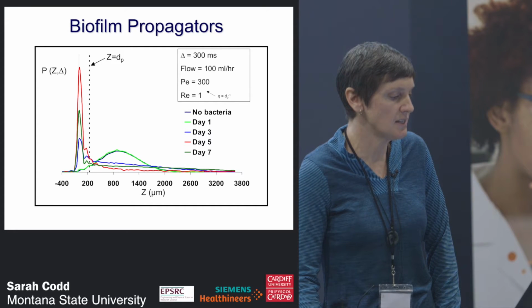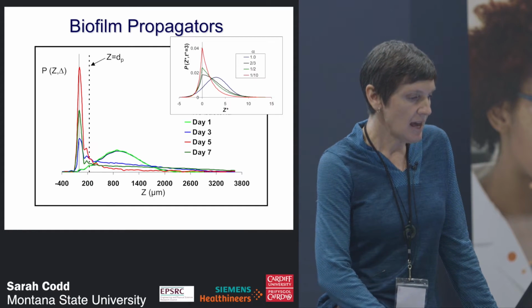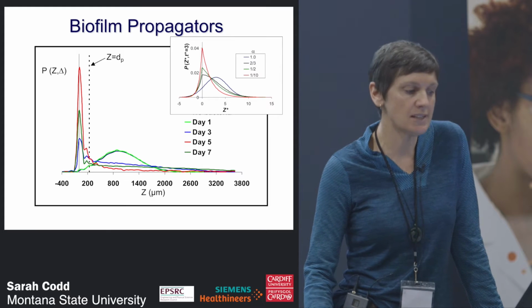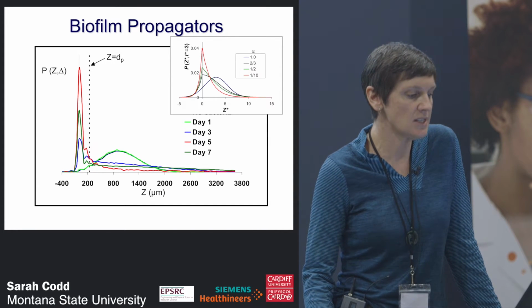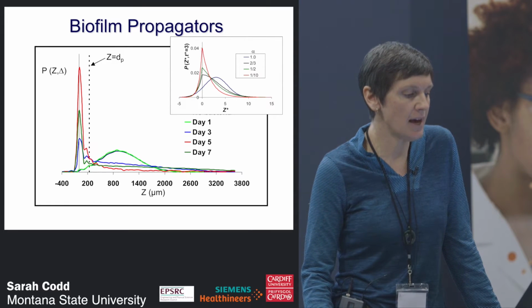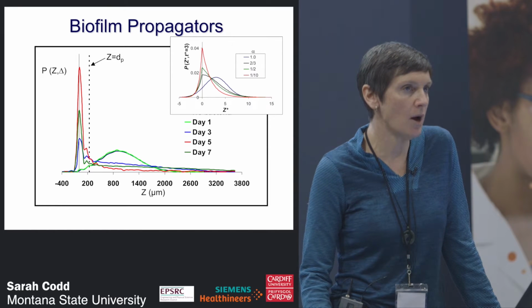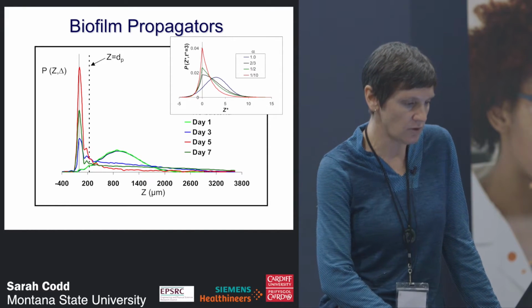And again, you can see these signatures here of the actual bead structure of the porous media that the molecules are in. And so that work finished with us applying fractional advection diffusion equations. Here's the data that comes from those models, with the proposal being that the biofilm growing in a porous media could be modelled with fractional advection diffusion equations.